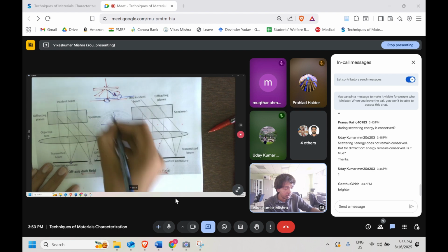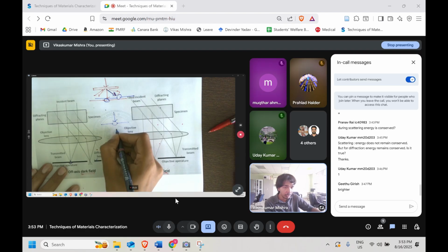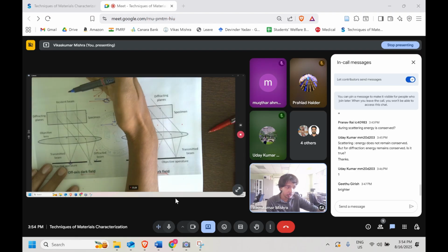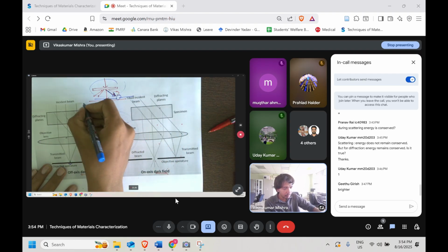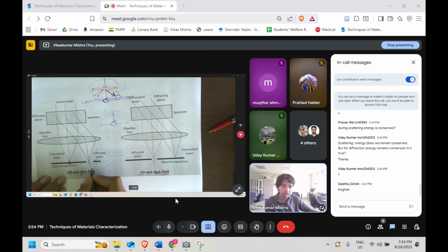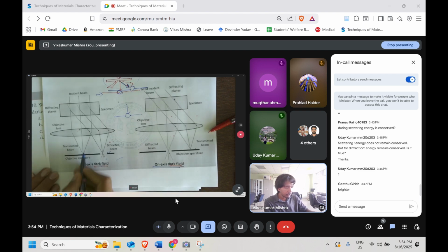You kept your specimen, you kept the aperture position as it is. So now instead of the direct beam from the same location, the diffracted beam is passing. Just what you did, you rotated the specimen. So you can either rotate this entire thing, or you can shift this thing. So now in this case, what is happening is the off axis dark field, not the on axis dark field. It's off axis because it's not along the direct beam axis.